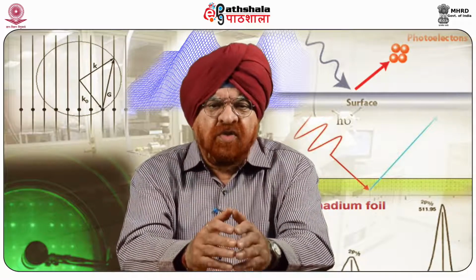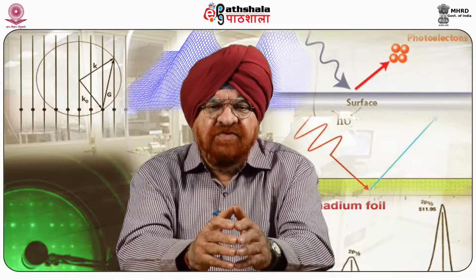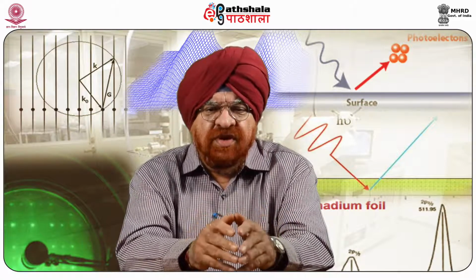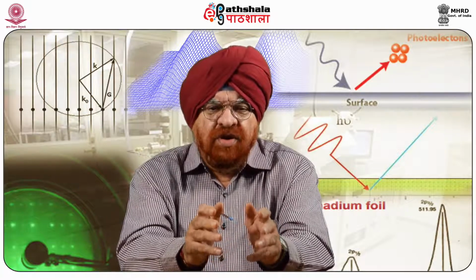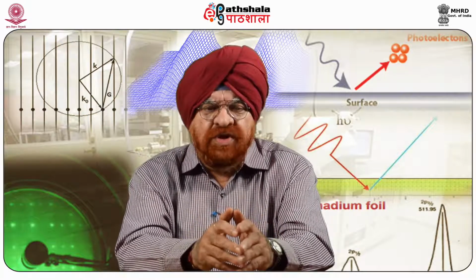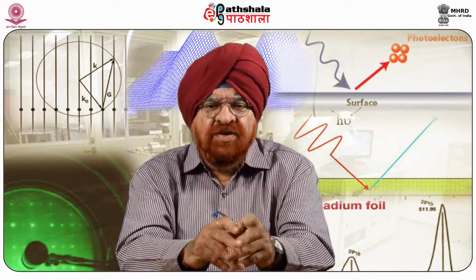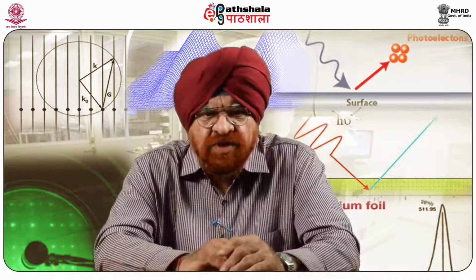In non-contact mode, the cantilever oscillates close to its resonant frequency at a small distance, 1 to 10 nanometers, above the surface, and long-range attractive forces induce changes in the amplitude, frequency, and phase of the cantilever.